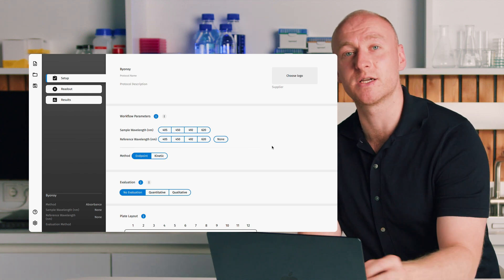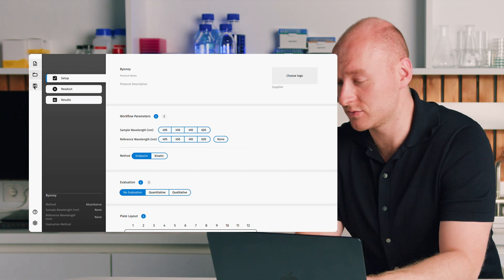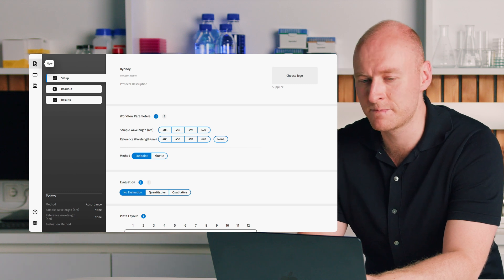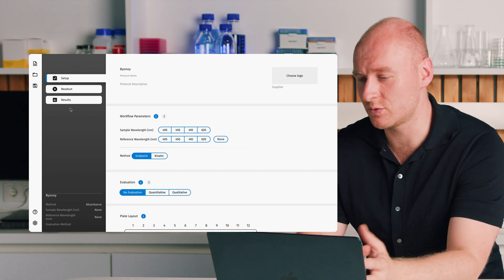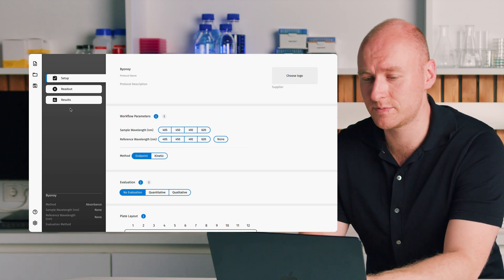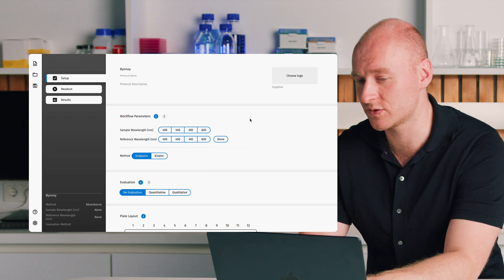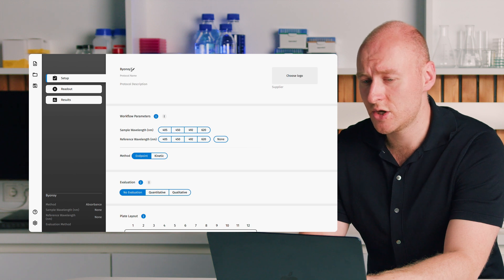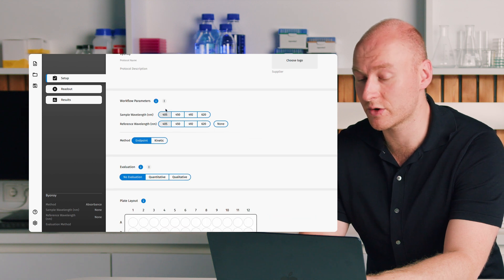On the left-hand side we have a classical menu bar, then our assay control bar showing where you are at any given step of the setup, and then the main window where you control all parameters for your assay. You can select a name, enter any name you want for your assay, and then get started with the workflow parameters.